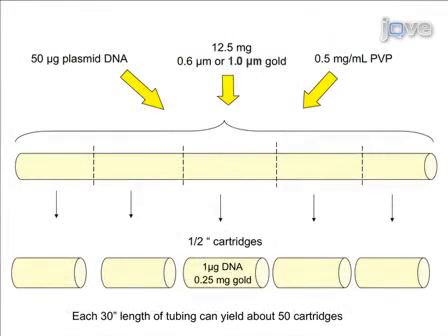For each preparation of cartridges, 50 micrograms of total plasmid DNA are mixed with 12.5 milligrams of gold particles and 0.5 milligrams per milliliter of PVP solution.